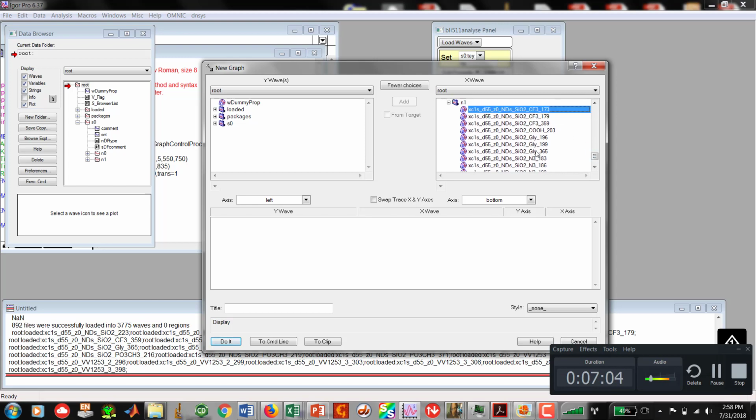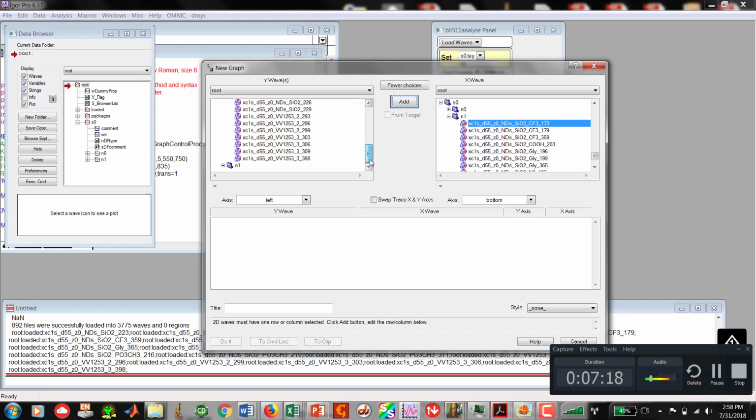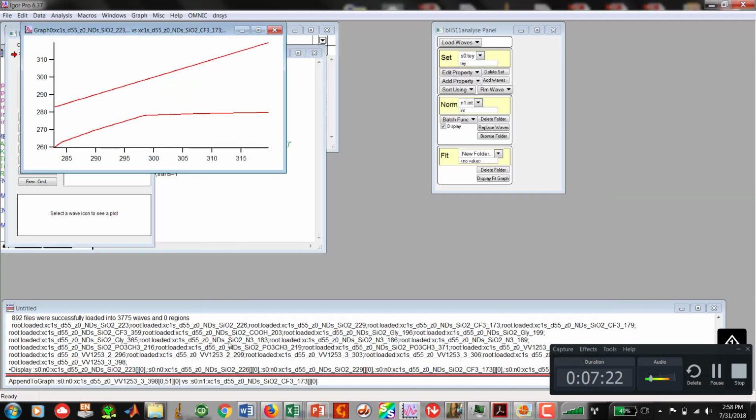And I'm just going to highlight all of these. Let's see if this works. All right, it won't let me, it only wants me to do one X wave. But on this side, I can definitely do all of the Ys. I'm going to hit add. I'm going to say do it.